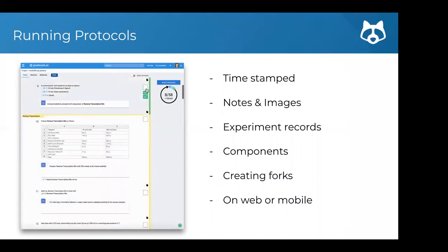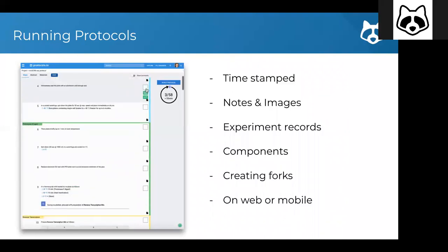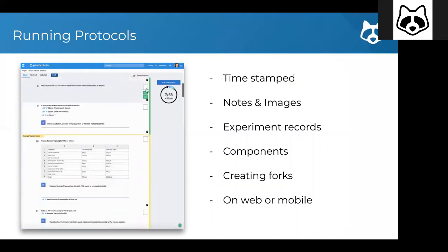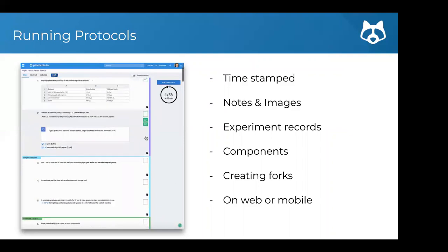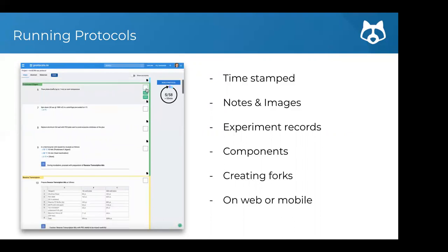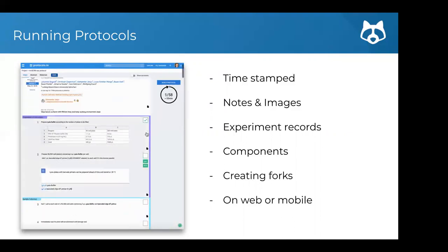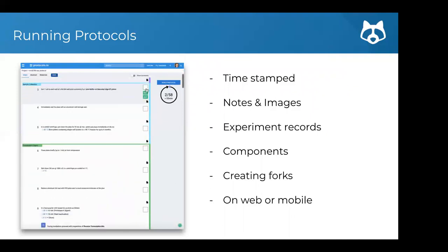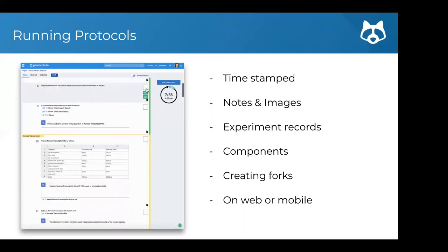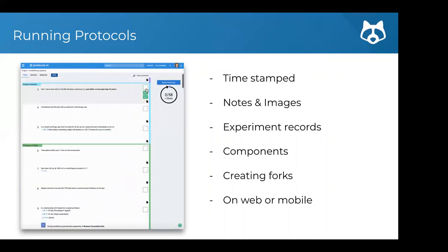If you make any changes during a run, we make it easy to create what we call a fork. A fork is not really a new version of the protocol but rather a modification — a different version that's still linked to the original so everybody can see where it came from, but it's a new protocol. This works great if, for example, you have a protocol developed for one organism and want to translate it to another organism — you can create a fork of that.